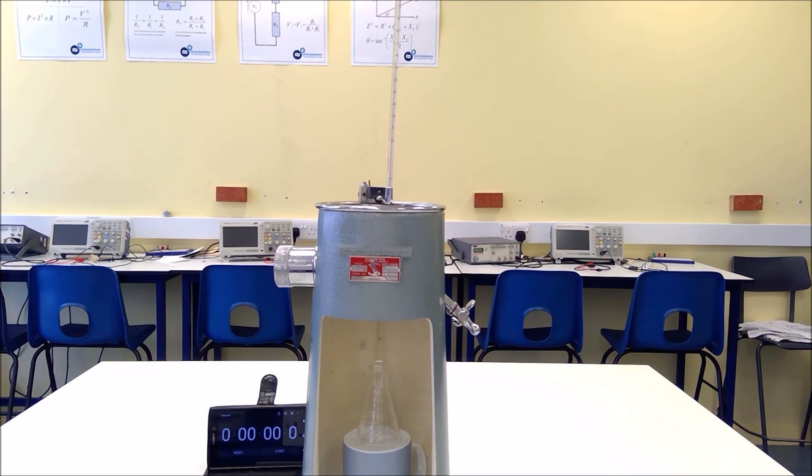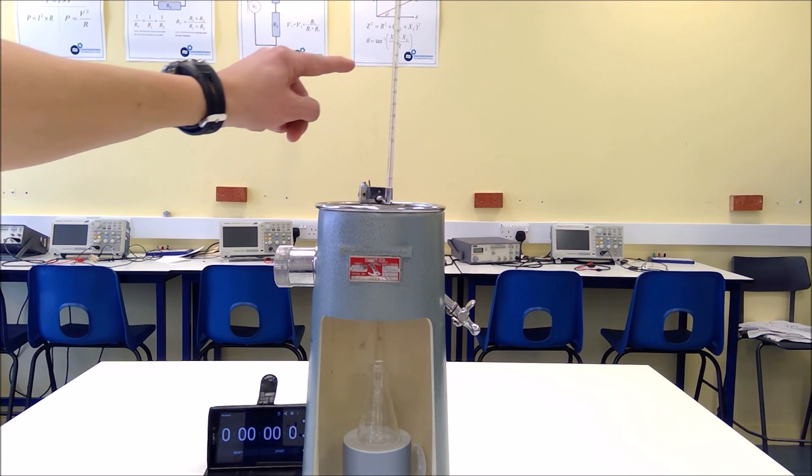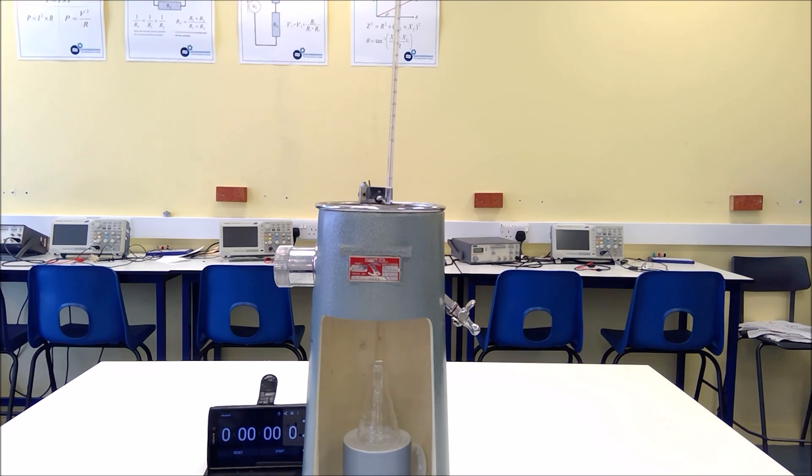For this test the temperature of the oil is at 55 degrees C, as we can see on the thermometer. We're going to lift the plug, start the stopwatch, and time how long it takes to collect 50 millilitres of the synthetic oil.